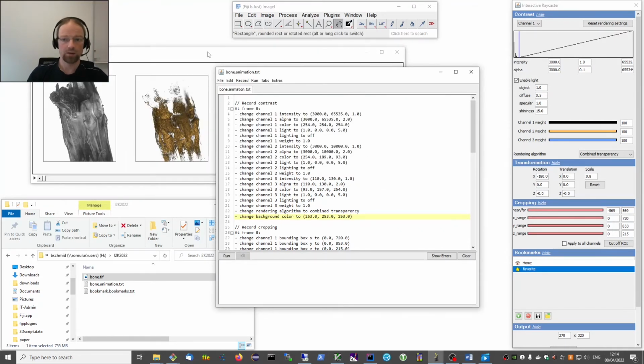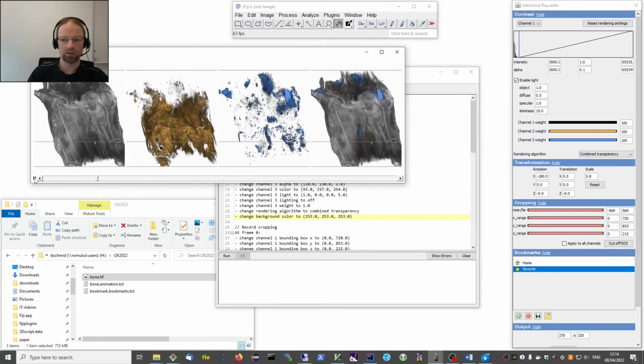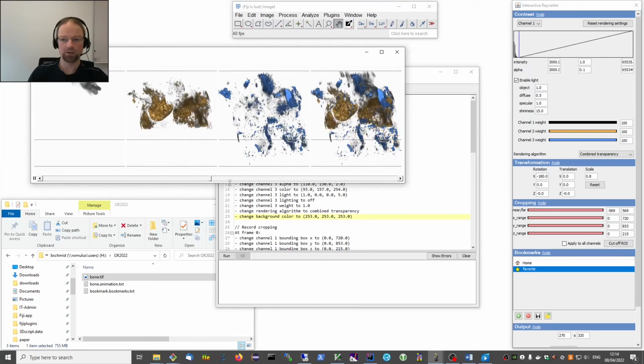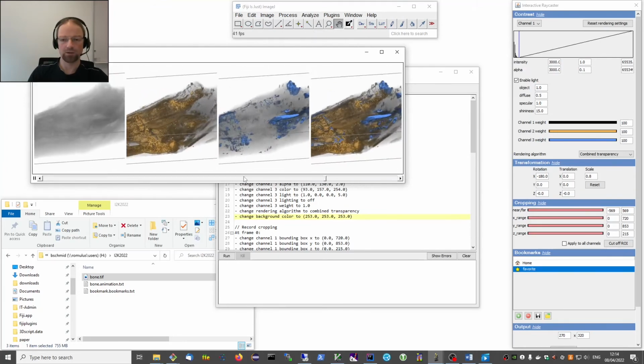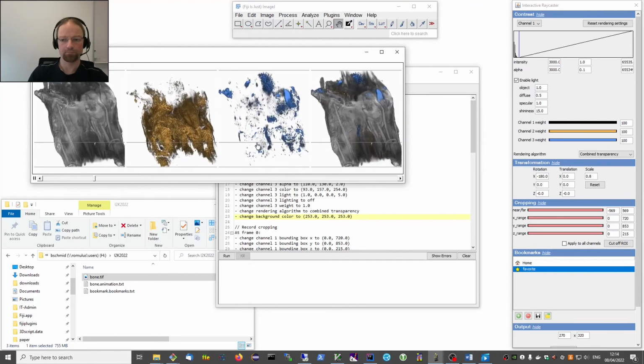Here it goes. And so what you see is now all the different panels placed side by side in one huge, more or less, video. And let's just play this. So I think this is really nice. Of course, if we crop one channel away, it doesn't affect the other panels. But I think this is also still quite a useful feature. Okay.